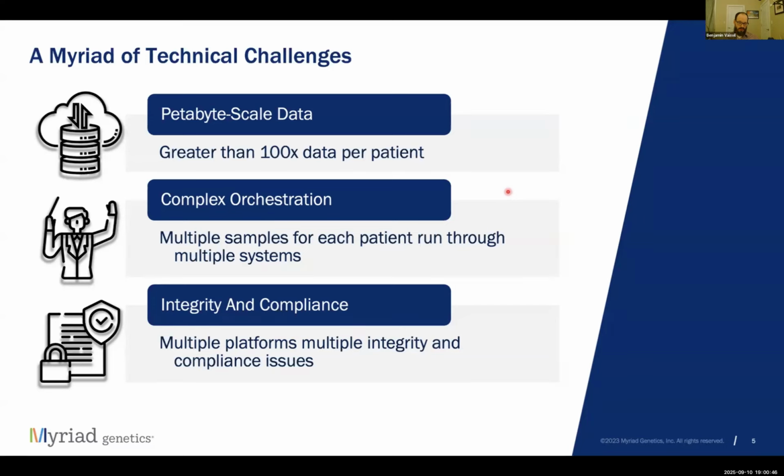We also need to make sure that we are keeping in mind integrity and compliance. Shuttling data between the lab and 3 cloud systems introduces challenges, ensuring data integrity at every point, and that data provenance must always be demonstrated.